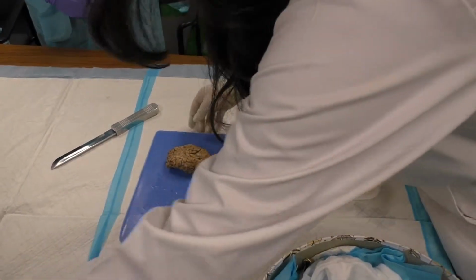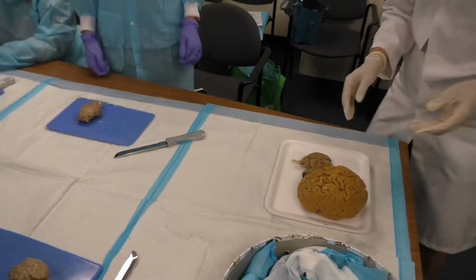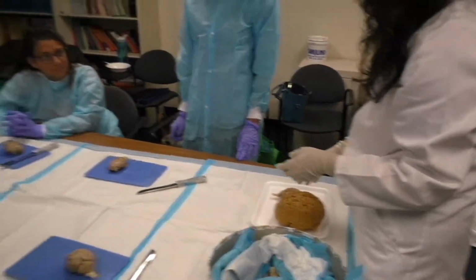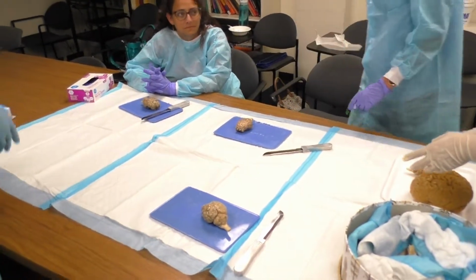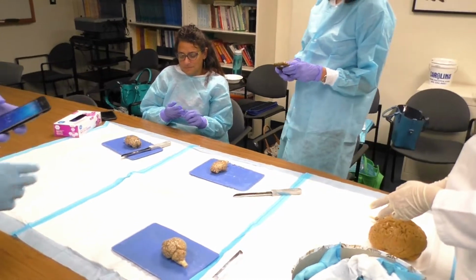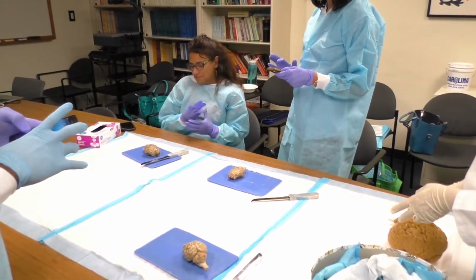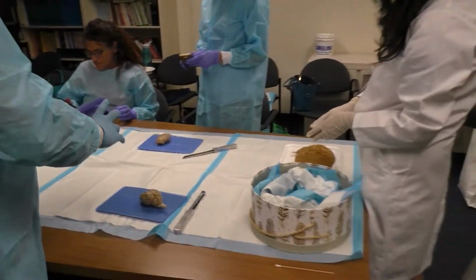Okay, so now I want to have you guys start with some photos of just the overall structure to illustrate what we've talked about so far. So where are the lobes? Top view, bottom view.